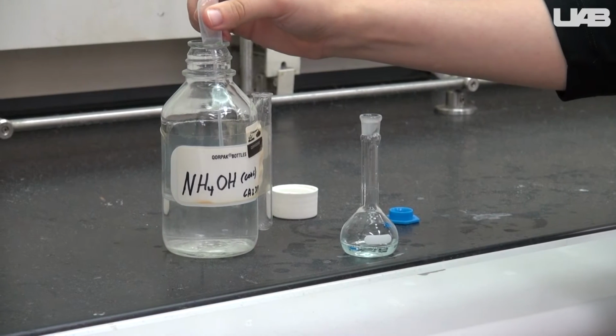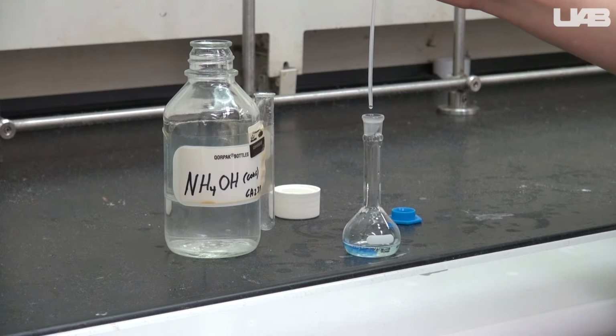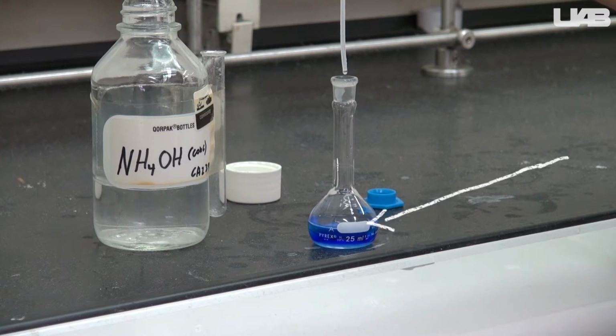Use a pipette to add drops of ammonia to the flask. Initially, the solution will form the insoluble copper hydroxide, but further addition of ammonia will cause the solution to turn a clear dark blue, which indicates that the copper amine has formed. Add a little extra after it changes color. Usually going up to the middle of this line on the flask is enough.